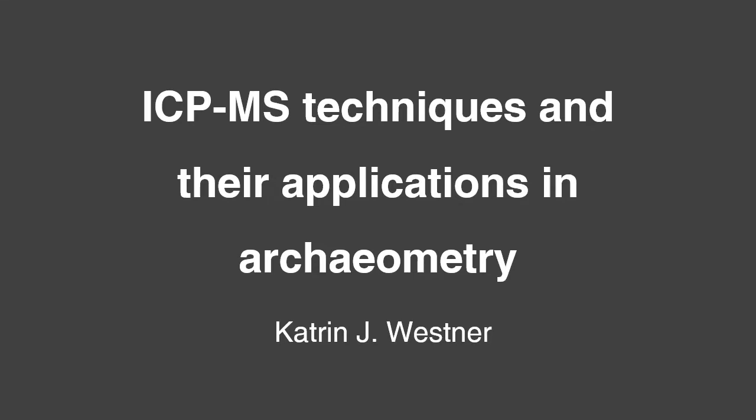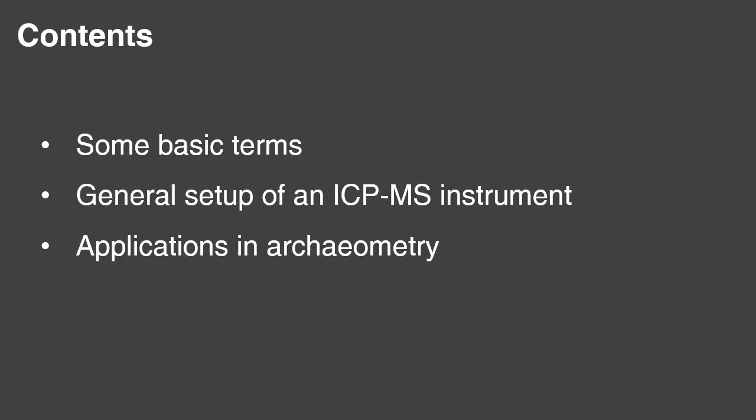Hello everyone and welcome to my presentation on ICP-MS techniques and their application in archaeometry. In this presentation I will first talk about some basic terminology necessary for the subject. Then I will describe the general setup of an ICP-MS instrument. Finally, I will present some applications of the technique for archaeometric research. First, let's start off with some basic terms.